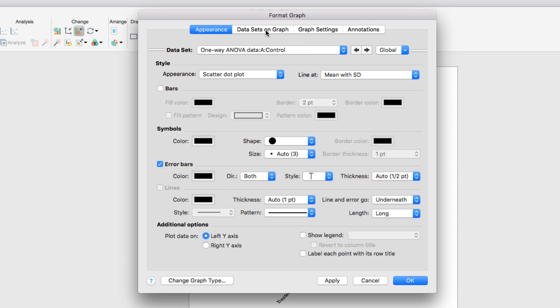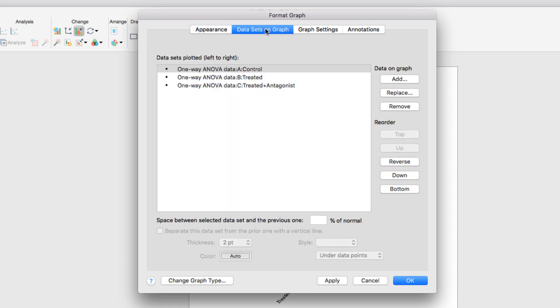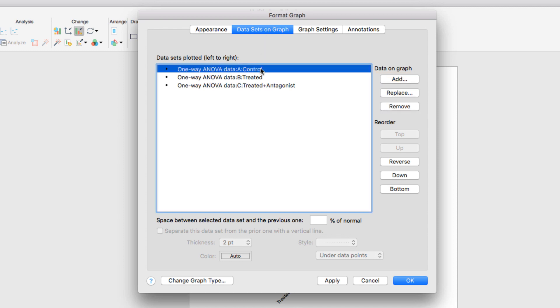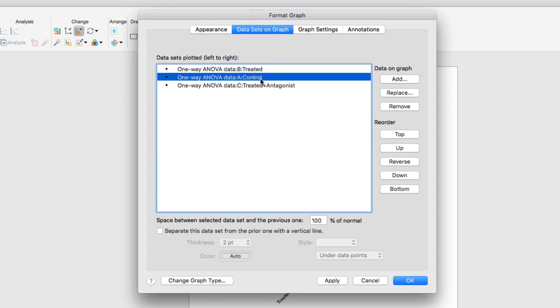The Format Graph dialog also lets you determine which data sets will be shown on your graph and in which order. For example, on this tab, you have the option of adding, replacing, or removing data sets on your graph and determining the order that they're shown simply by clicking and dragging them within this window.